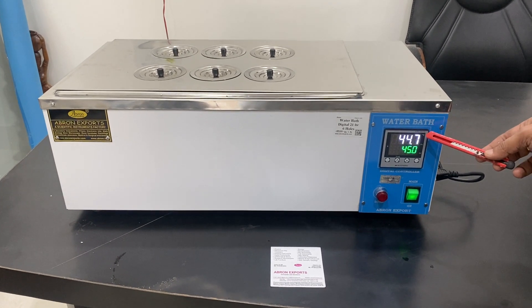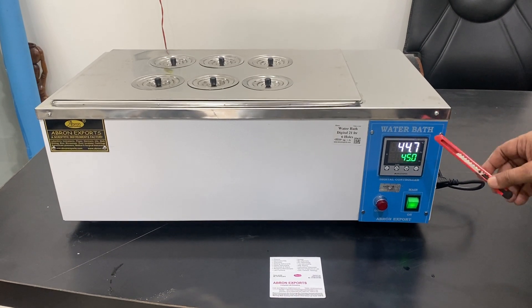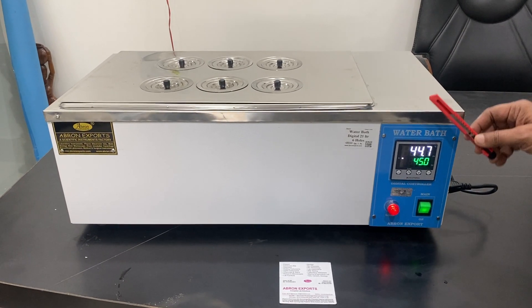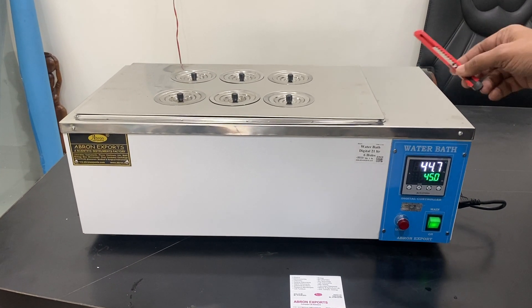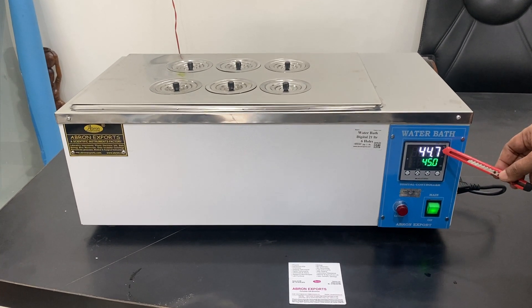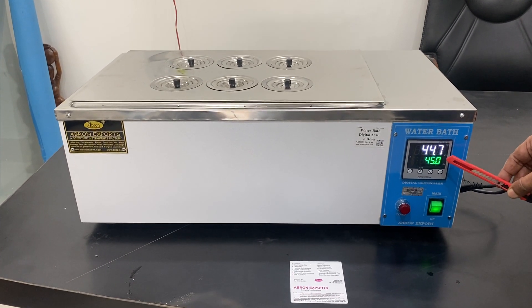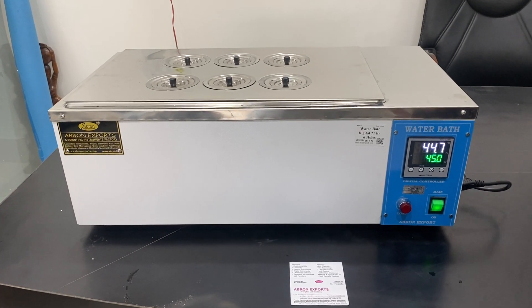This is a water bath with digital control with an accuracy of 0.1 degree. This is not a precision water bath — the precision water bath comes with a stirrer where the water is shaking continuously. This one will have similarly one or two degrees accuracy, but the accuracy of the digital PID is 0.1 degree.